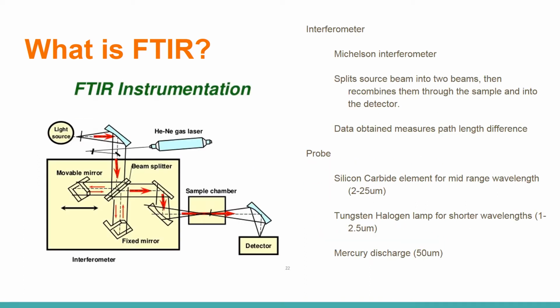Here is the beam in the image. It's generated by starting with a broadband light source. It contains the full spectrum of wavelengths, like I said earlier. The light shines into a Michelson interferometer, which has a certain configuration of mirrors, which is moved by a motor. And as the mirror moves, each wavelength of the light in the beam is periodically blocked and transmitted by the interferometer. Due to wave interference, different wavelengths are modulated at different rates so that each moment the beam coming out of the interferometer has a different spectrum.